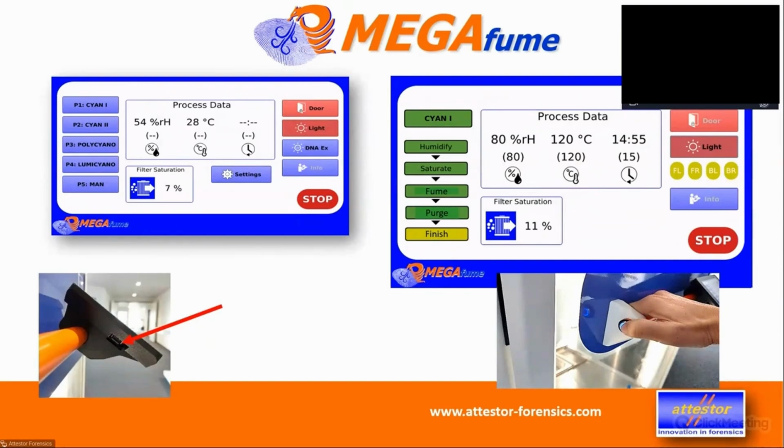Every 30 seconds it records the time, the date, the program you selected, the set points of temperature and humidity, and the actual values of temperature and humidity. It monitors the filter saturation and it just stays in there. There's a massive SSD hard disk drive in there. It stays there unless you need it. And if you need it, you put a USB pen drive in there, and the system then says, do you want to download the files?